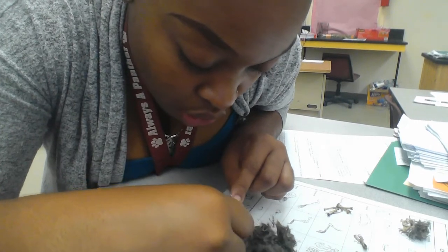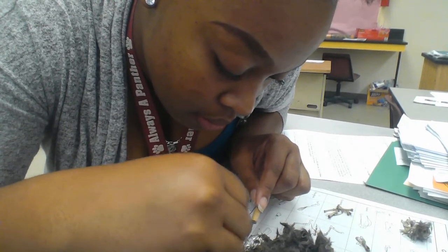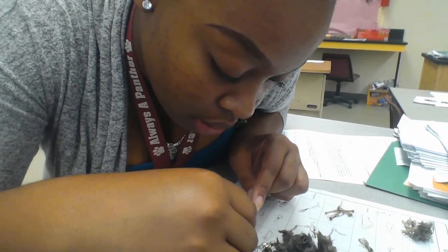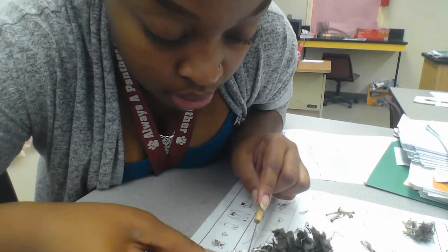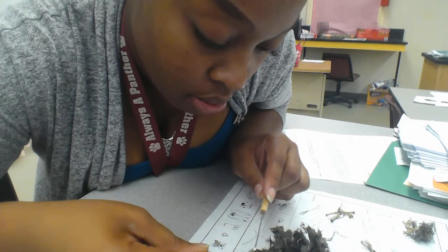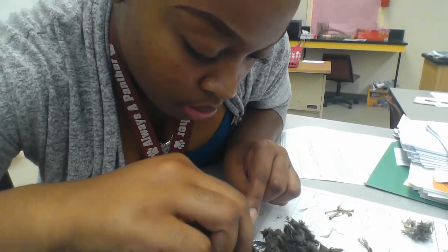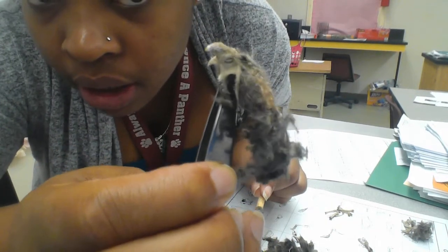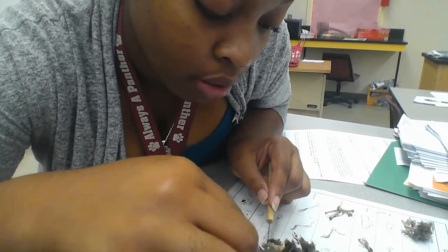I think I found, no, I found a 4th rodent. Found a 4th rodent, guys. Like I said, I'm going to try to get all the fur out so you can see it, but probably won't be able to. You see it. All right, so those are the teeth on the inside there, that's the side of the rodent face. Those are the teeth. So technically it's a 4th rodent right there.